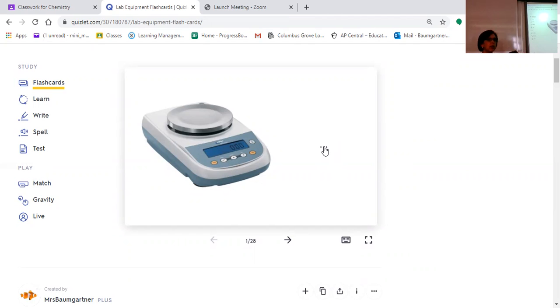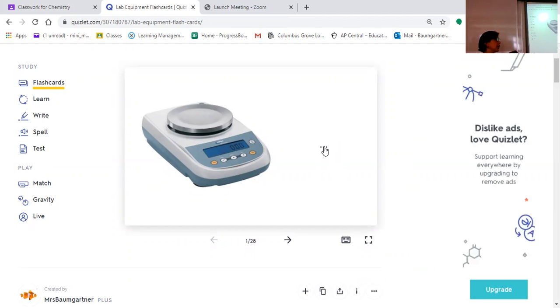You're going to see these tested two different ways. I'm going to give you guys 5 of these diagrams, and you're going to have to tell me what the equipment is. And then the other thing you'll have to do is I'm going to give you a list of equipment and then some activities, and you'll have to tell me what piece of equipment you would use. So you're going to want to take some video or some notes on this as you go to keep track.